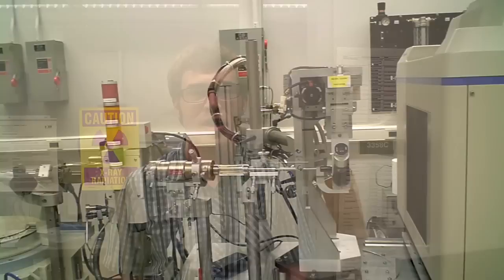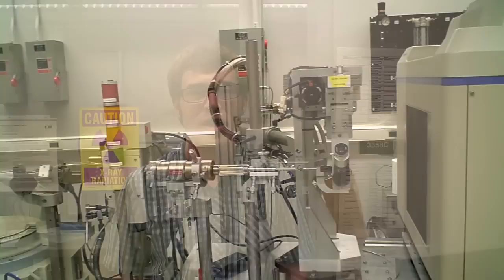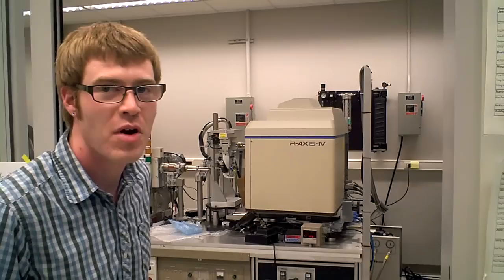Since time at the synchrotron is limited we use our home x-ray source to test initial crystallization conditions and determine if our crystals are actually protein crystals. We also use this setup to test and see if we have good cryo conditions for our crystals.